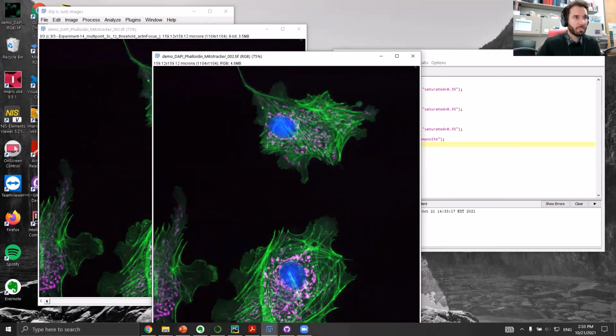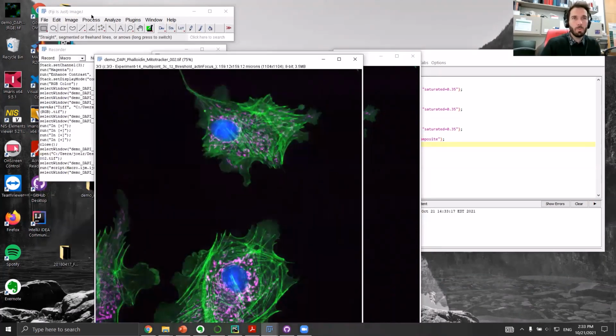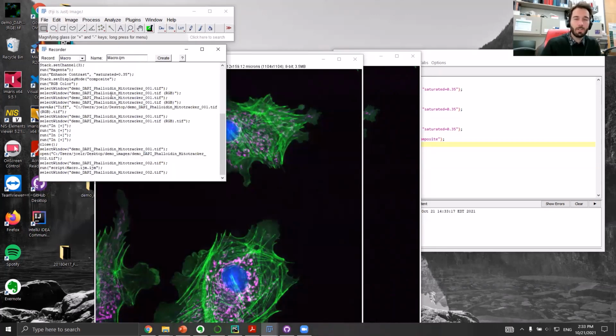Everybody good? I know that for people who have done a little bit of scripting before, this is super introductory, but for those of you who it's new, this is generally the workflow. We're trying to figure out what we want to do by pointing and clicking, and then getting the functions from the recorder. That's most of what we're doing. In the following exercises, we're not done with this one, we'll try to find where that might fail or where there are little things we can add to make our lives a little bit easier.